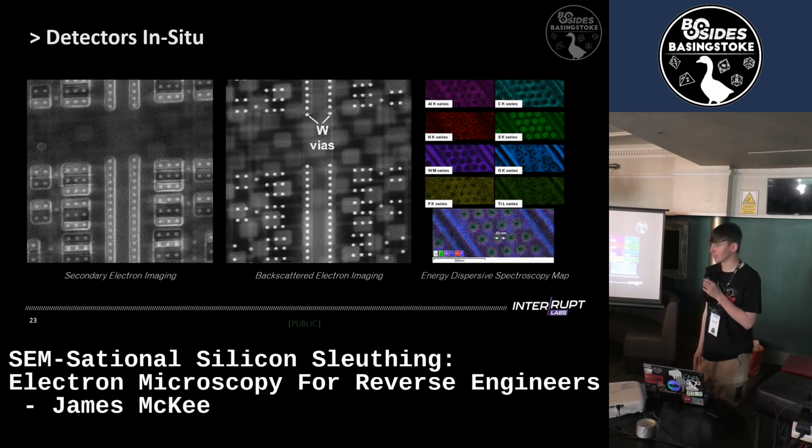The other nice one is the EDS. We can actually tell that these tungsten elements consist of this chemical composition. You get colors for elements, and we get the entire elemental composition, which is a good part of the image. So that's how the SEM actually produces an image.